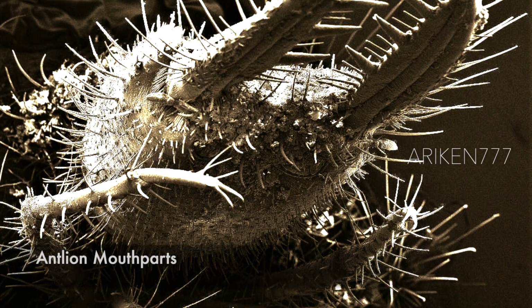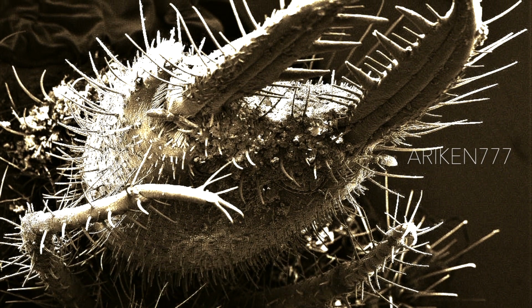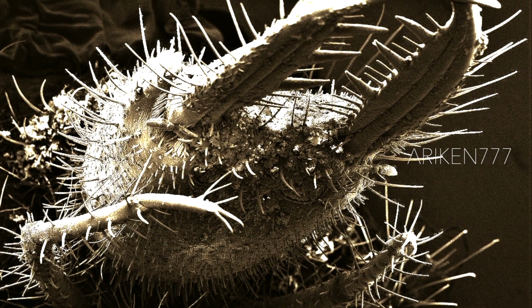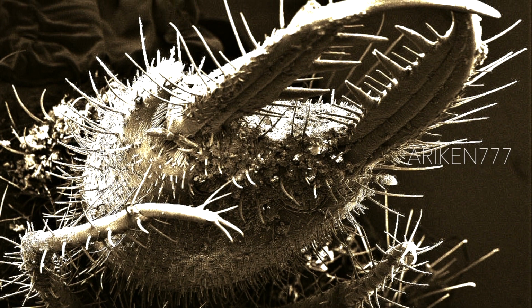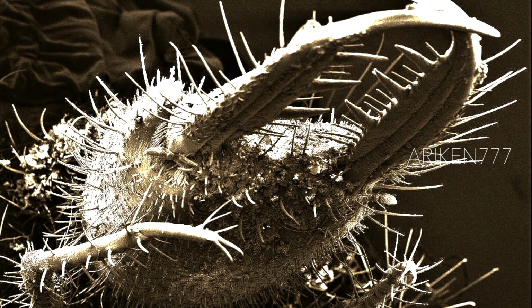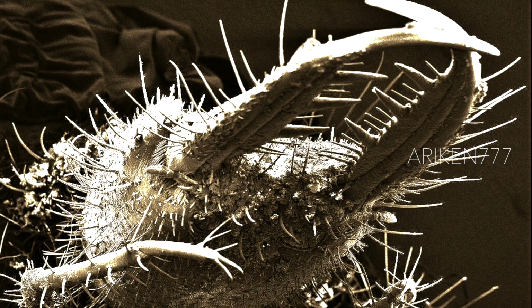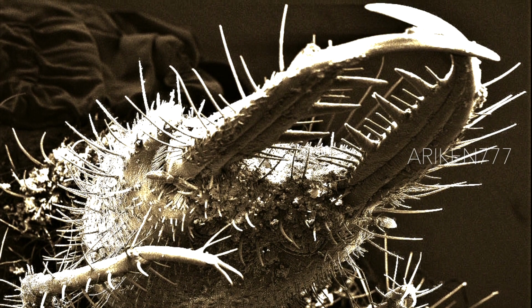Mouth parts of an ant lion. The larval form of this insect lives at the bottom of a cone-shaped hole where it waits patiently for any unsuspecting prey. When ants or similar insects fall into the hole, the powerful jaws of the antlion crush and kill the prey. Another name for the antlion is the doodle bug.